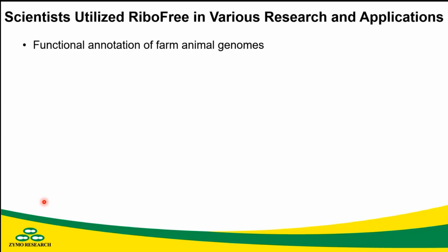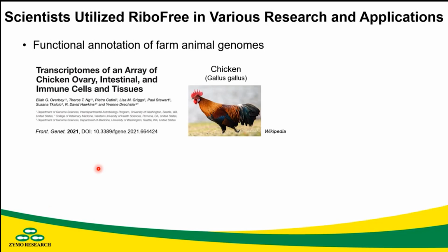So let's get to the third part of this discussion, that is to showcase a couple of interesting papers that I've seen on how scientists are utilizing Ribo-free in various research and applications. The first three will be more general, beyond microbial transcriptomics. And then I'll share three that focus on different aspects of microbial research. The first one is about chicken.